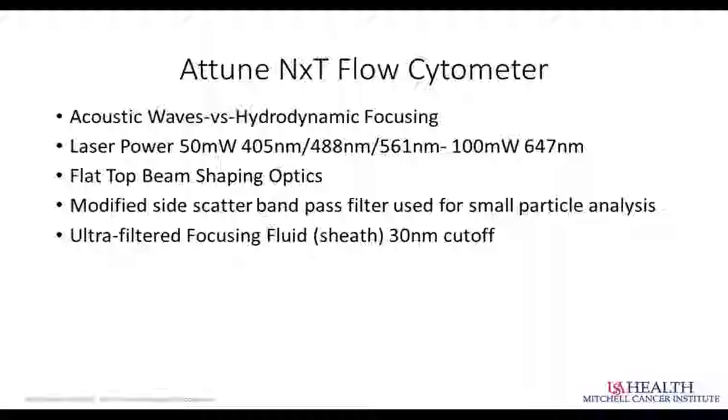When you look at acoustic focusing versus hydrodynamic focusing, you can achieve much tighter peak CVs compared to traditional cytometers. It really is aligning those particles much more precisely as they cross through the laser beam.